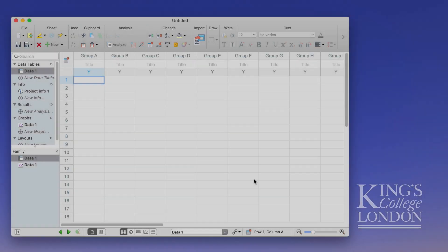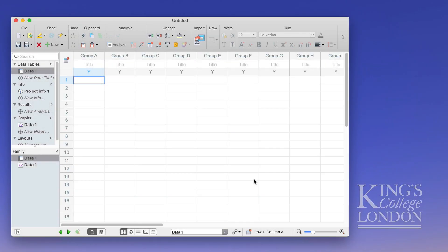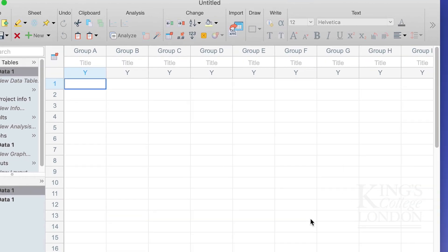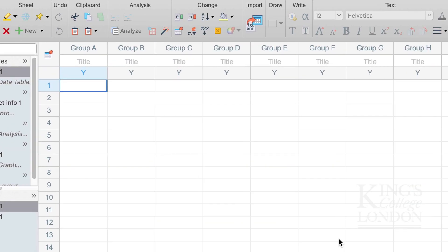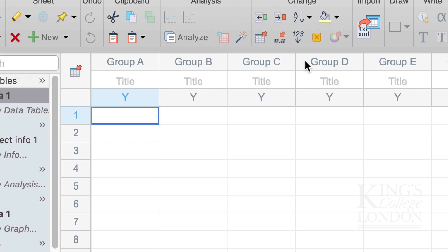By default the new data table labeled data1 will appear on the screen in front of you and you'll have a list of groups at the top of the table. You can see here Group A, Group B, Group C, Group D, etc. And each of these will have a title. At the moment these titles are left empty.